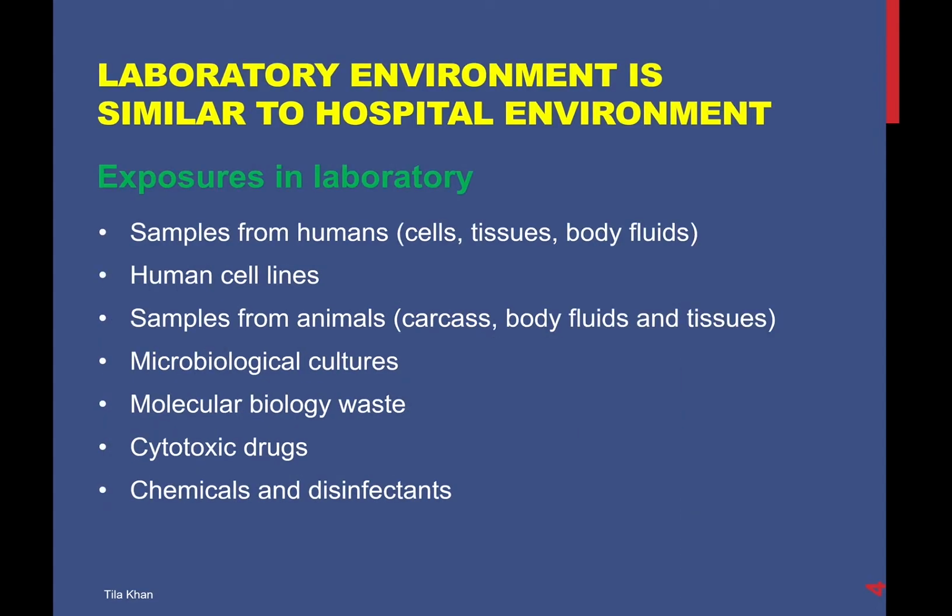Laboratory environment is similar to hospital environment. This is a very important statement. Please remember this statement since we are at risk of exposure to different kinds of samples from humans, human cell lines, animal samples, microbial cultures, molecular biology waste, cytotoxic drugs, as well as chemicals and disinfectants. All of these exposures put us at risk of diseases and other health hazards.